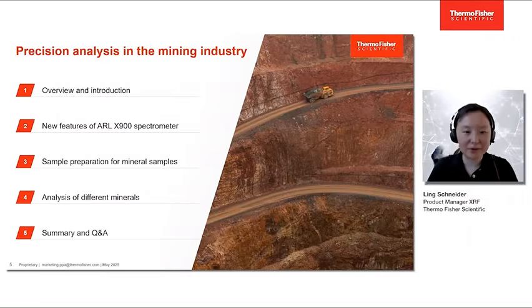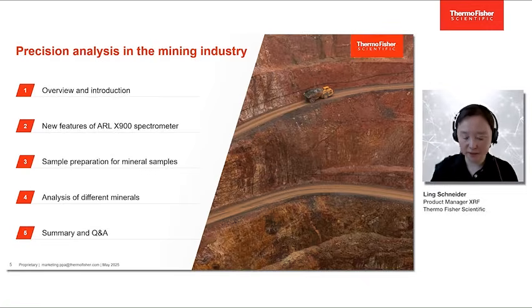Let me first show you what we have prepared for you today. I will start with a short overview and introduction of the new ARL X900 spectrometer, focusing on its new features. Then we will dive into the applications in mining, focusing on the sample preparation methods and analysis of different minerals. At the end, I will give you a short summary and we will continue to the Q&A session.